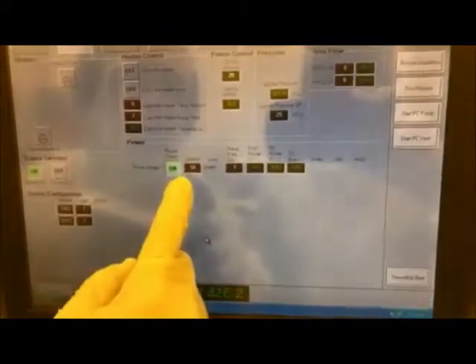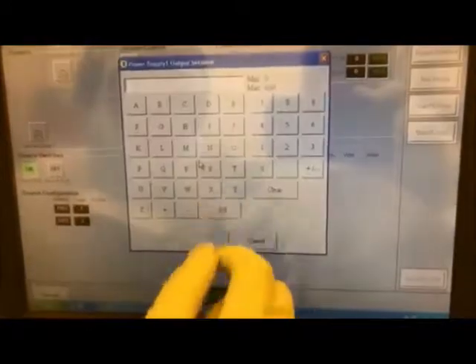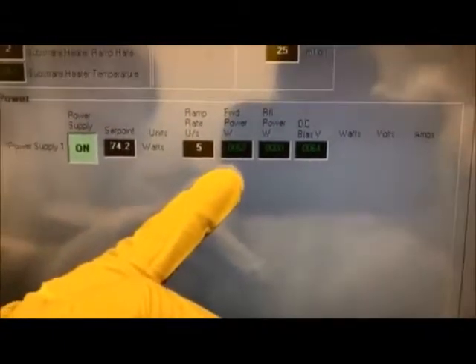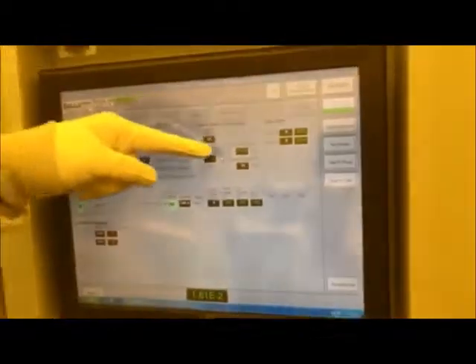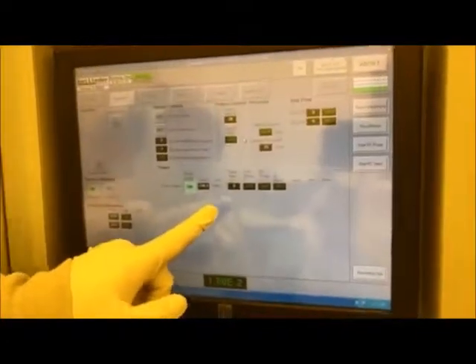At the same time, we will bring up the power by 50. So start from 50, we are going up to 100, and click enter. You can see the power is gradually going up and the pressure is gradually going down to 25. We have to check the plasma every time to make sure the plasma still stays on. So the plasma is on. Once the pressure goes to the set point, and the reverse power is still low, once again we start with the ramp.